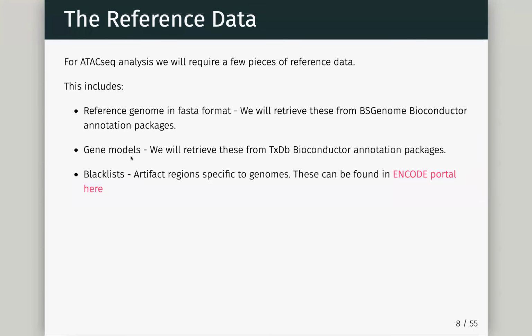But what they did is trawl through all the ChIP-seq coming out of the ENCODE study, and they started to see that there were regions of the genome which just had signal no matter what you were trying to chip for. So if you're looking at MYC, CTCF, polymerase ChIP, there was always signal there. And it turns out from our work and other people's work that this is basically to do with repeat expansion. It's because your genome's got bigger than you think it is.